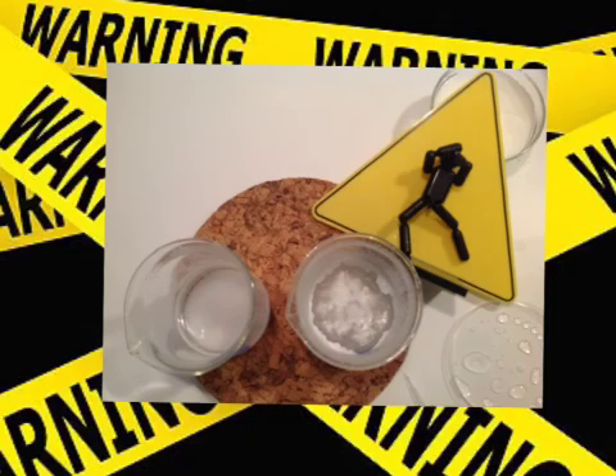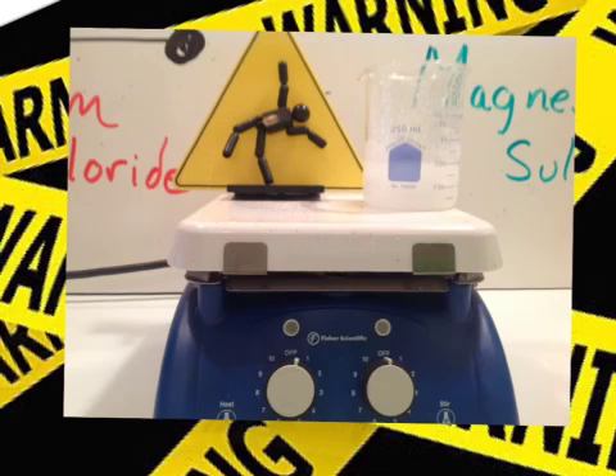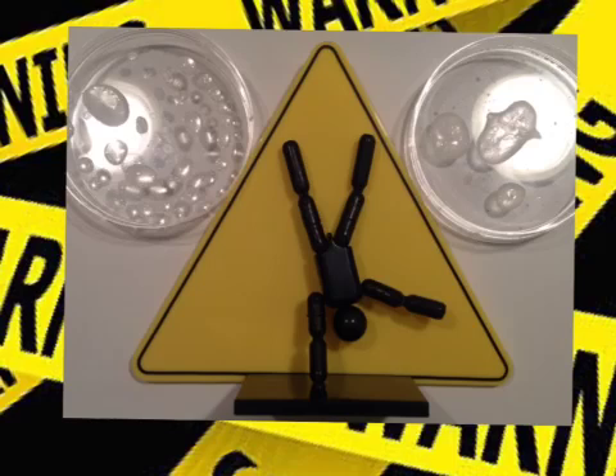Some warnings — this is not a lab that you can take lightly. You have to wear goggles. We're working with hot salt solutions and we don't want that in your eyes. Things will be very hot; we'll have boiling salt solutions. If there's any horseplay, you're out of the lab. We don't want people to get burned, we don't want anything splashed on clothes, and we don't want people to damage other experiments. So respect the lab, keep it clean, and take care of the equipment.